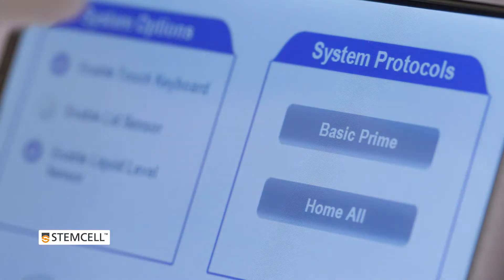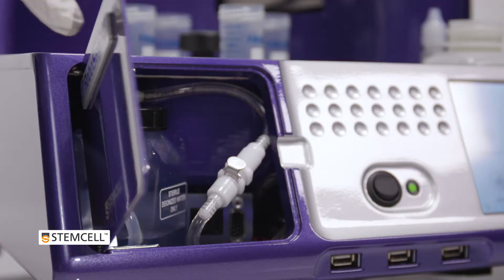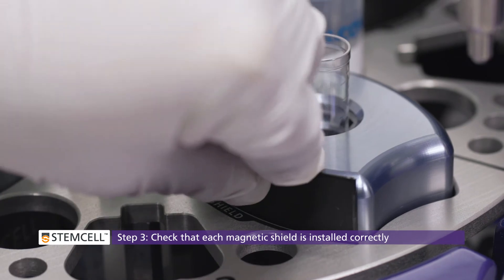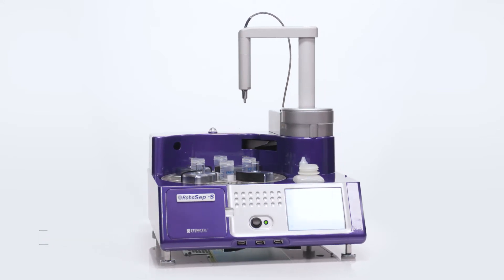After the hydraulic fluid bottle is refilled, follow the priming protocol described in Section 3.5 of the manual. After ensuring the hydraulic fluid bottle is at least half full, check that the magnetic shield is installed between the magnet and the sample tube in each quadrant. Now, you can select the desired protocol for your run.